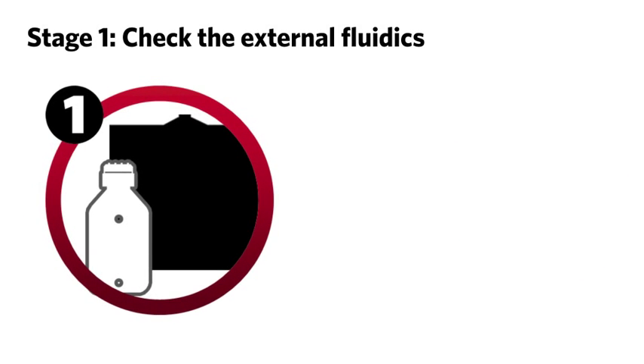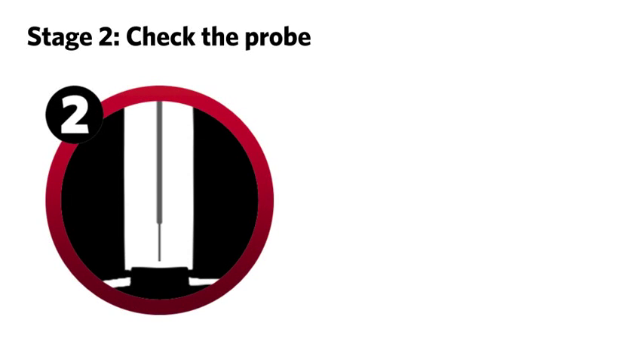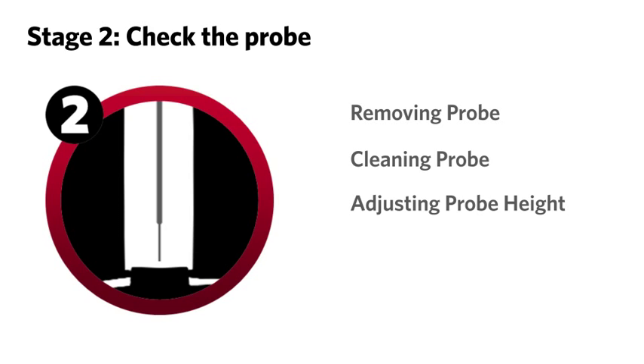Stage one: check the external fluidics of the Luminex 200, consisting of the sheath and waste fluid bottles or containers, fluid lines, and connectors. Stage two: check the probe, consisting of removing, cleaning, and adjusting the height of the probe.